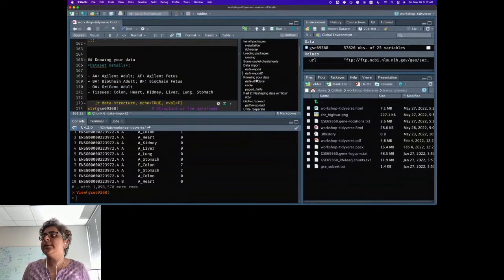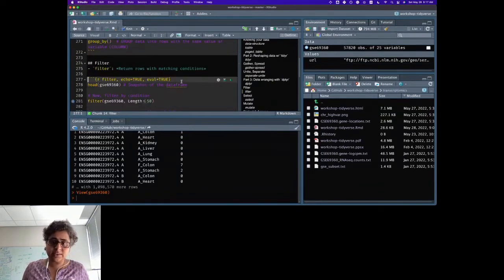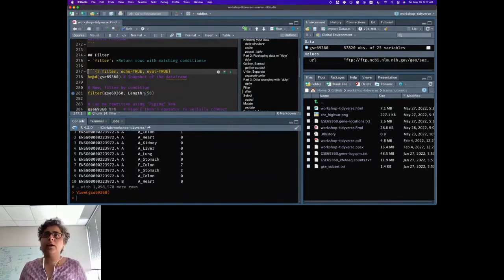Then I converted it into a longer format. And then after that, I hope you're with me. Does it answer your question? That's brilliant. Thank you, Janani. Okay.